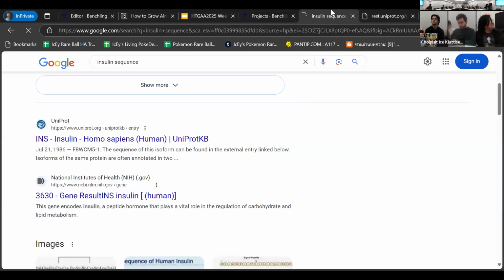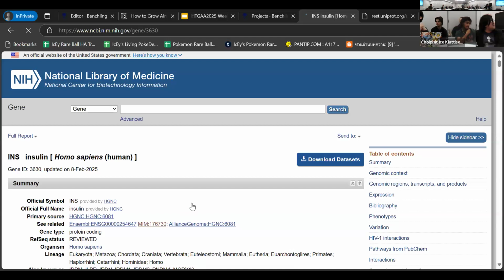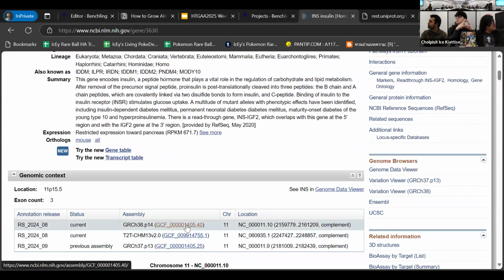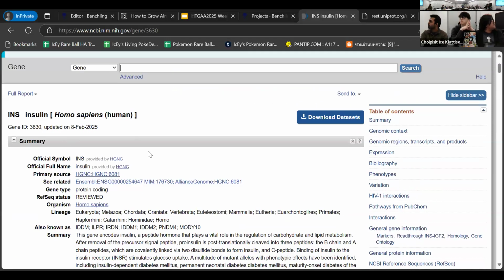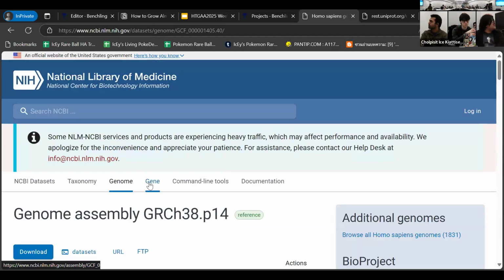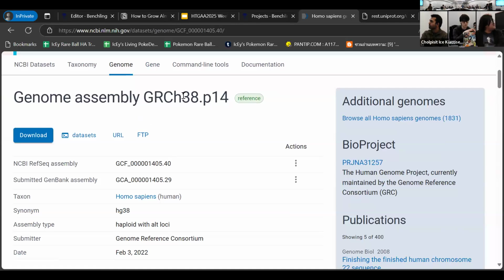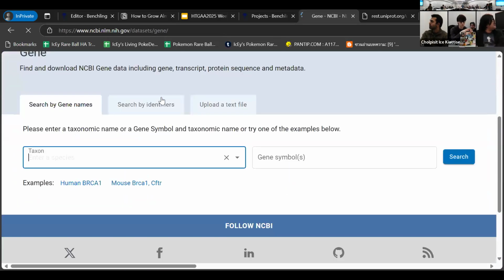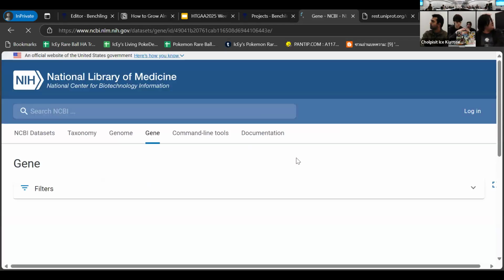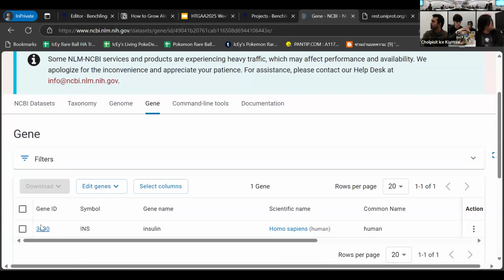the NCBI database, you see this kind of information. There might be more of them. These are more particular about this information. This seems more like a database. Going to here, you see more assemblies and more things. These are the genome assemblies of this particular information. Go for insulin. Then you get more genes, and this is what shows up as a gene ID.